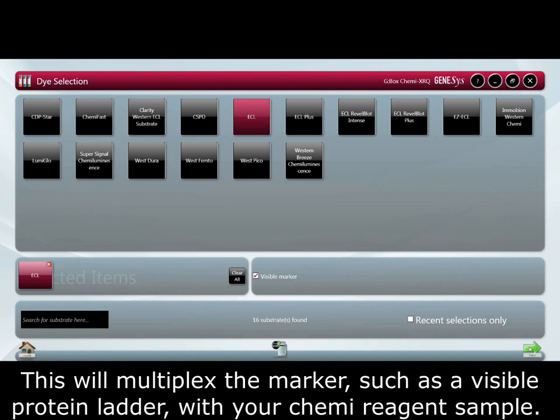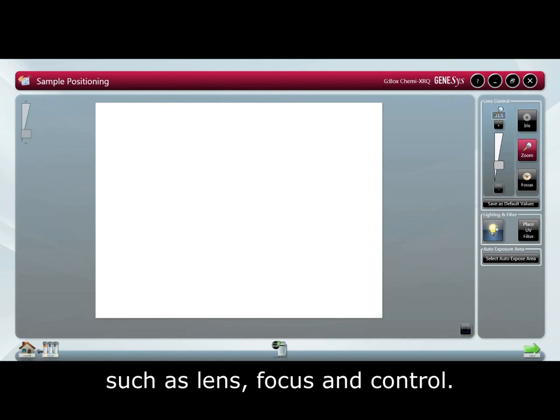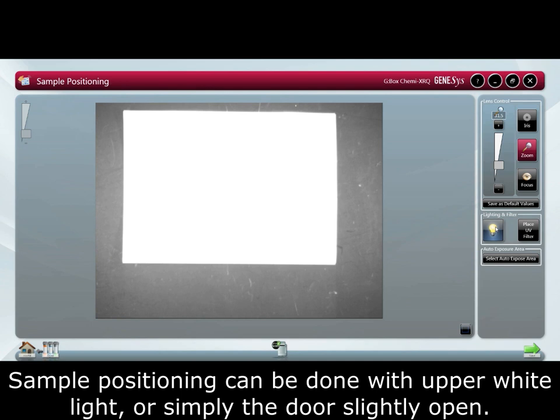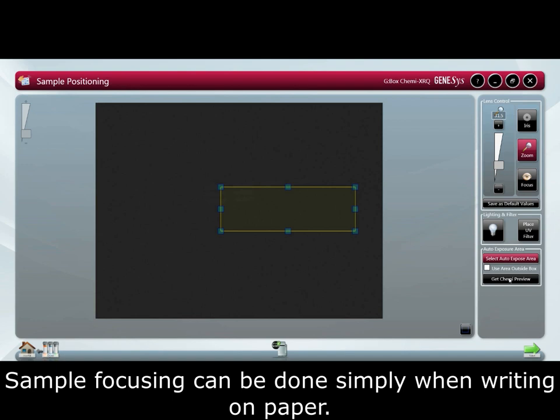In the image preview tab, we can make sure the sample is positioned correctly, with options such as lens focus and control. Sample positioning can be done with upper white lights or simply the door slightly open. Sample focusing can be done simply when writing on paper.